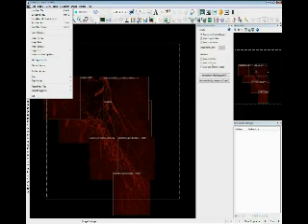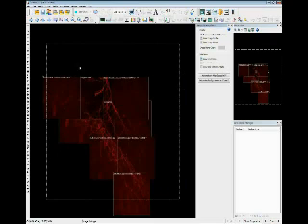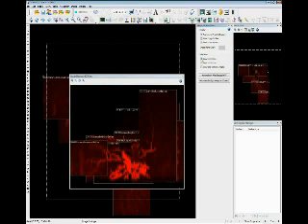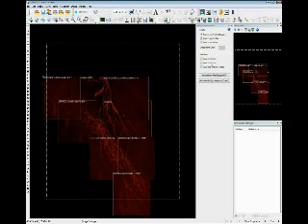Okay. One other thing I just want to point out is that we also have different side views. I didn't show that before. So now you can see the XY view here. And then if we bring up the XZ window, you can see the image stacks and move them individually if anything needs to be nudged or improved upon from the automatic view. We also have it for YZ as well.